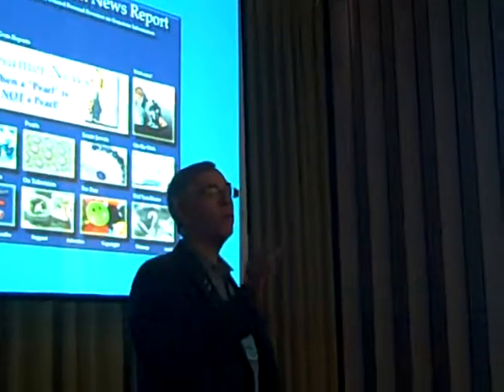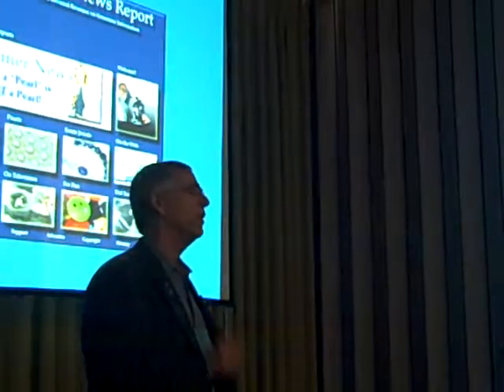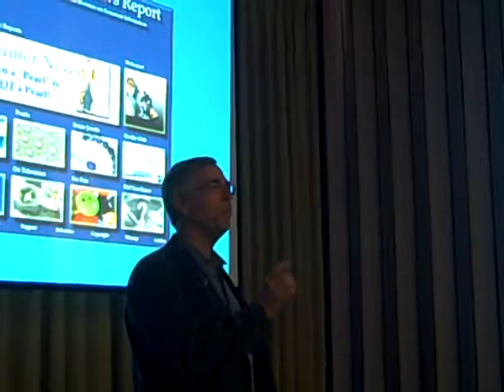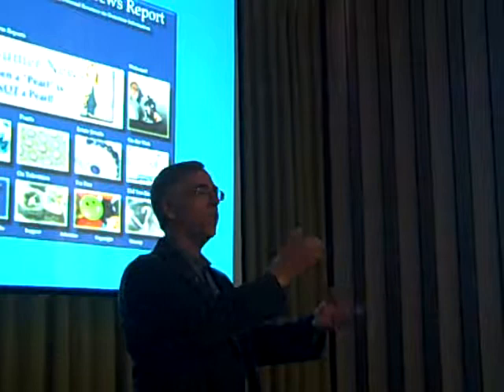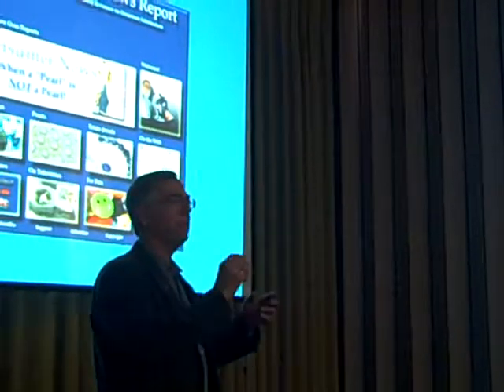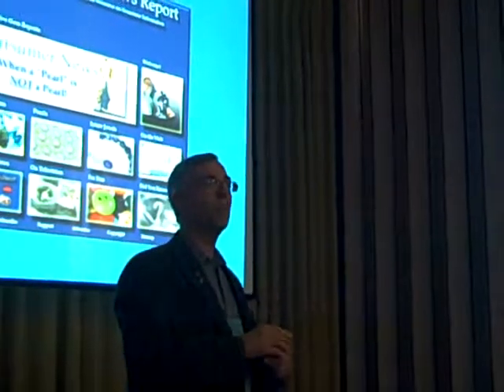Okay, well, one more test to do, put it in the polarizing microscope. We might as well, because we brought it down. Let's just take a look. Take a look at the graining pattern of the Hope diamond, and you get a certain look all the way around. You're looking at the stone under cross-polaroid plates, looking at the graining inside the stone. They're taking video, they're taking images on the computer of the graining pattern, and it looks pretty cool.